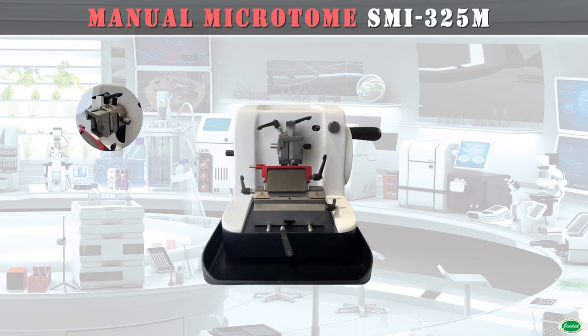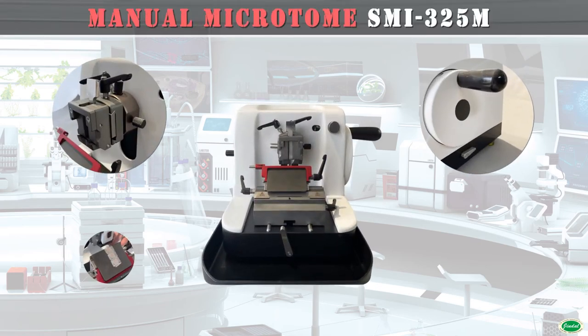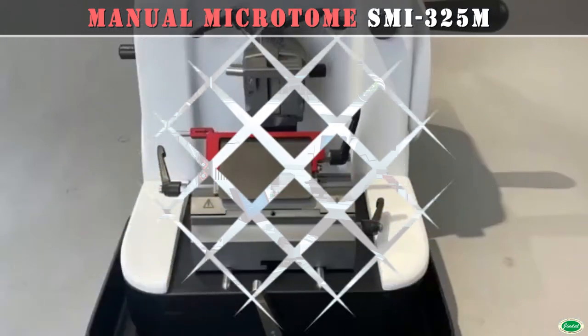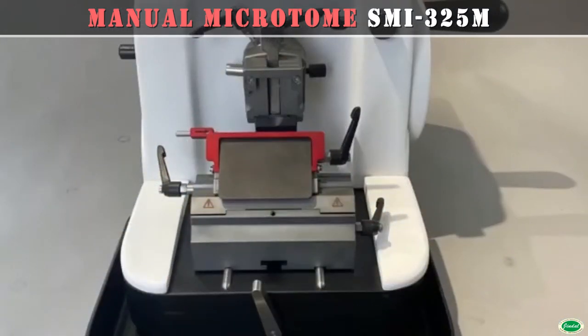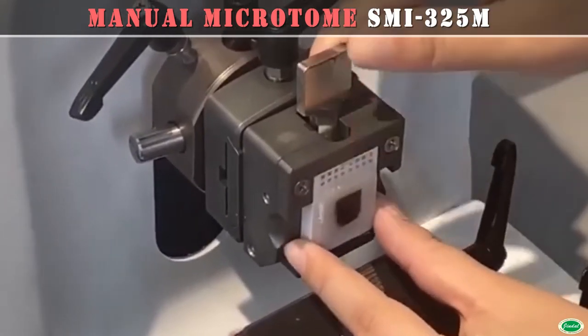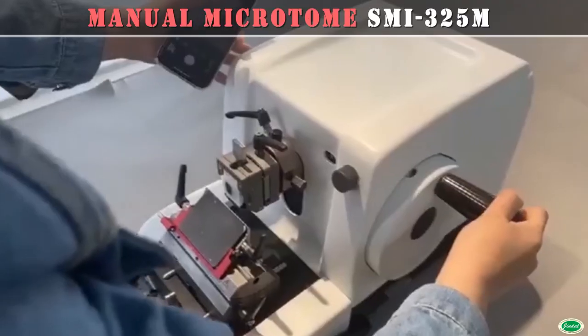Stability of manual microtome is vital, and Jindal's new modular design manual microtome successfully meets the workload requirements of demanding laboratories. The superior precision of new accessories adds expediency to the block-to-knife approach as well as specimen point of reference. Microtome is the instrument of choice for clinical histology and histopathology applications.